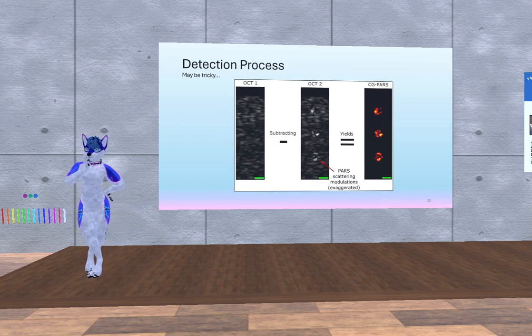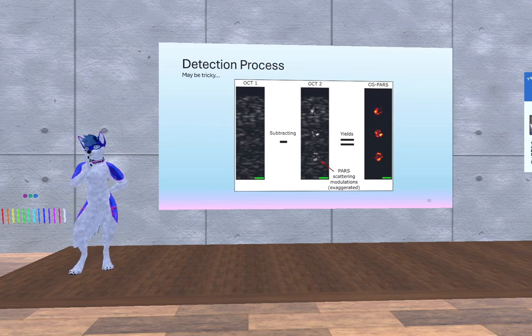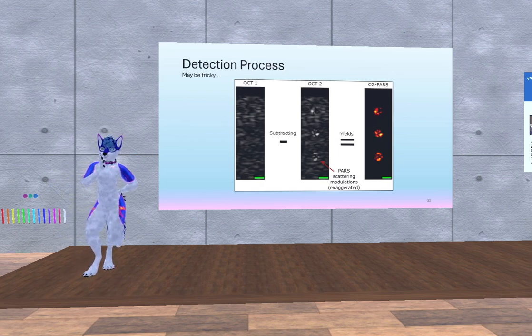I was hearing how you were saying biological things are always on the move, and as a result, they are hard to capture. But I can imagine that it's not possible for all kinds of biological living things. But if you could isolate blood cells and cool them down to a very low temperature, would that actually increase the accuracy of the imaging that you get with the techniques that you are using, or does temperature not matter?